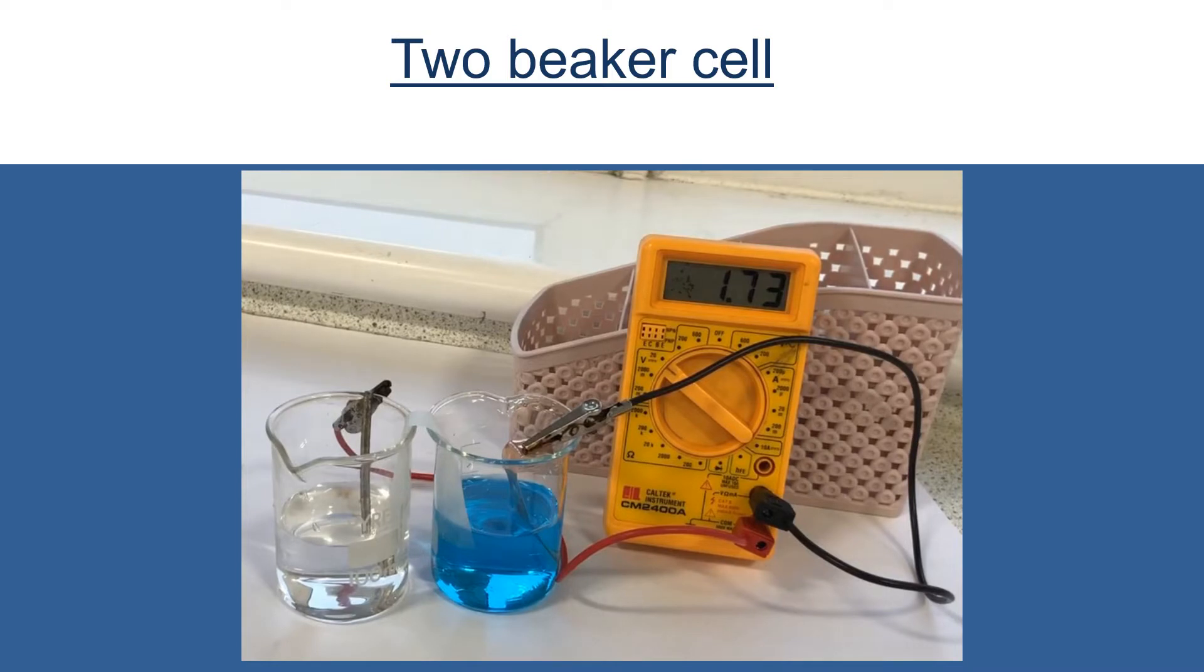Chemical cells involving metals and solutions of their own ions. In our left hand beaker we've got magnesium sulfate solution and we have a piece of magnesium sitting in that, attached to our crocodile clip and into our multimeter.